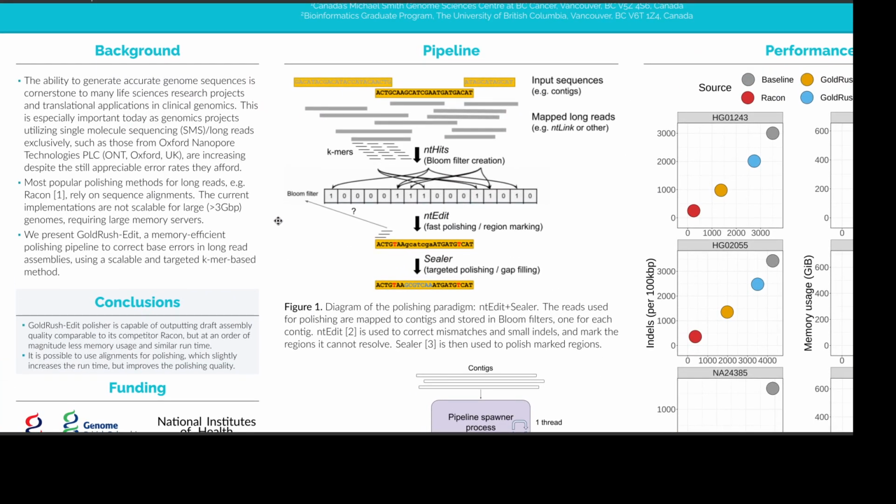So long reads are very widely used in genomic applications, but they still come at appreciable error rates. They include mismatches and indels, and this is an issue if you want to do, say, genome assembly.